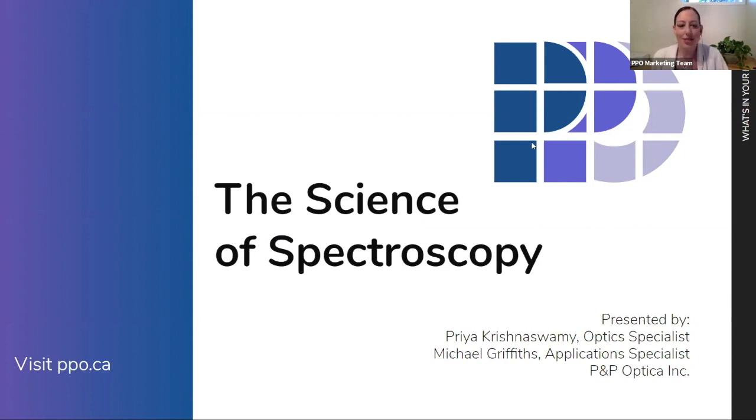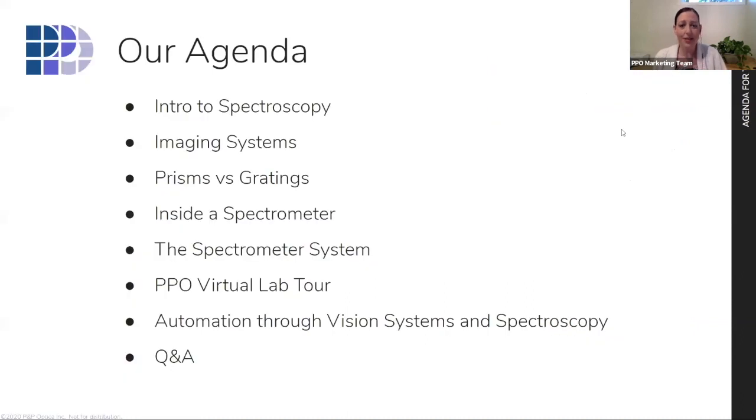Let's jump into the agenda, Priya, if you don't mind. And we'll take a look at what we're going to cover this morning. So we'll start off, Priya, and who I'll introduce in a minute, is going to go through the science of spectroscopy. So introducing us to the concept and some of its history, talking through some of the components, so imaging systems, prisms and gratings. We'll go actually inside the spectrometer and take a look at the components. And we will talk about the spectrometer system itself.